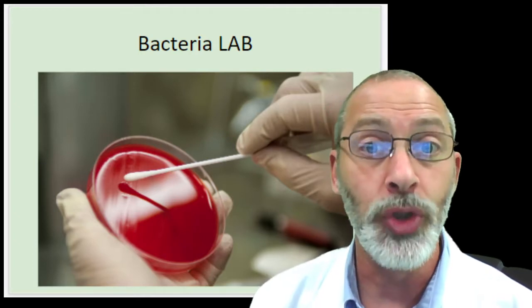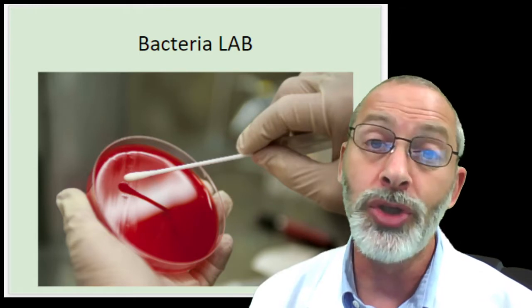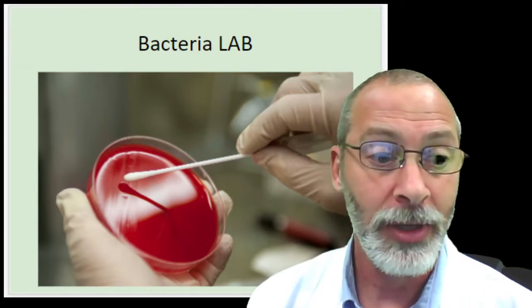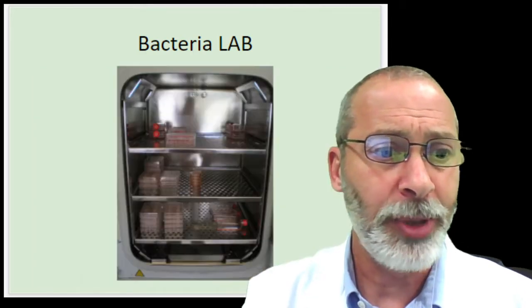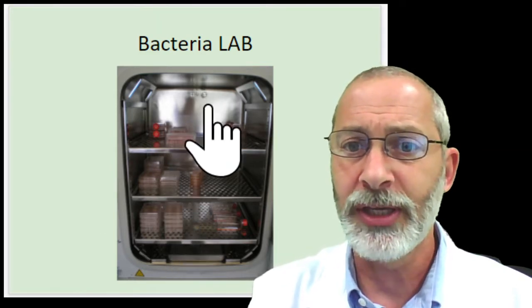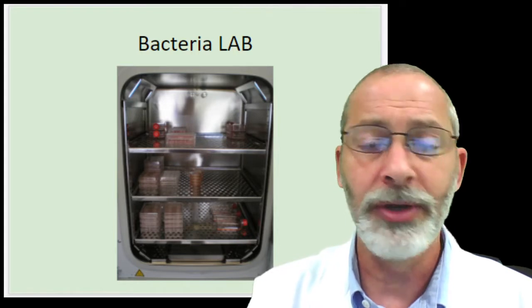Remember, bacteria do reproduce on their own, as long as they have a suitable environment within which to do so. And so we have created the ideal environment, the incubator and the agar, for them to reproduce. And so here's a picture of the incubator in which they have been placed for several days. And there are different shelves in the incubator and a thermometer at the top. There's a door on the incubator that closes so that we can monitor the temperature.